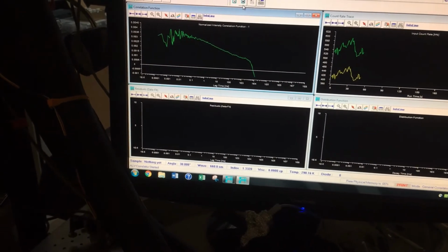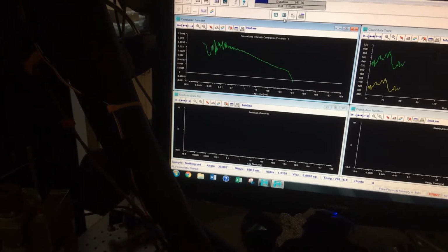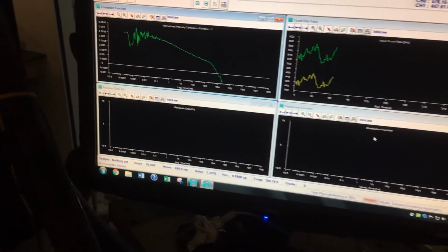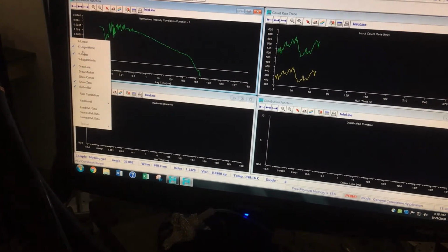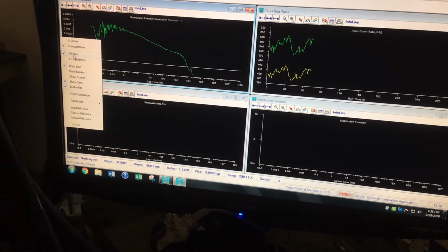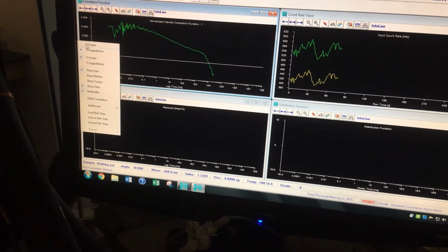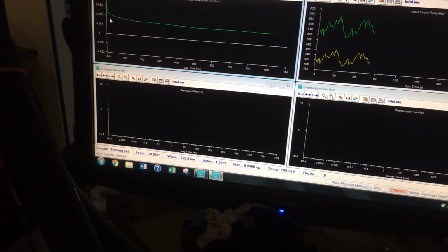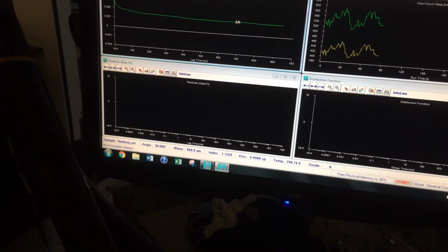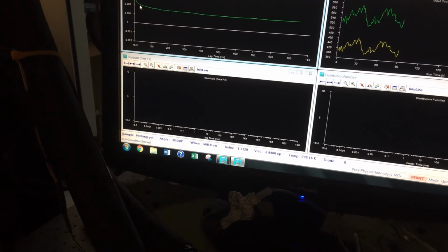So I think what we'll do in practice is let this run for a little while and then try to fit the baselines. I wonder how this system looks in other representations. Let's just see what it looks like if we go to a linear x. Yeah, it's much more like an exponential decay in that sort of system, right? So I could come out here and fit a baseline, or just take that as the baseline, and fit the rest of this.